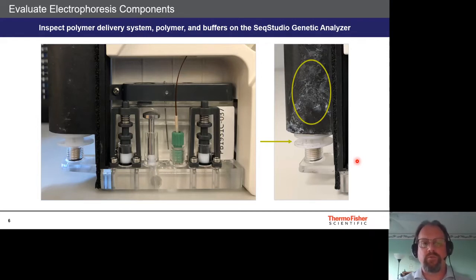Remove the array for evaluation. On the SeekStudio cartridge, the polymer delivery system should be clean with no debris present. If you see crust on the PDS or around the array, that indicates a polymer leak and the array needs to be replaced. Examples of polymer leaks include dried crust around the array tip and on the PDS surfaces — these can create spikes in electropherogram data, introduce particulates that interfere with electrophoresis, and cause arcing events.